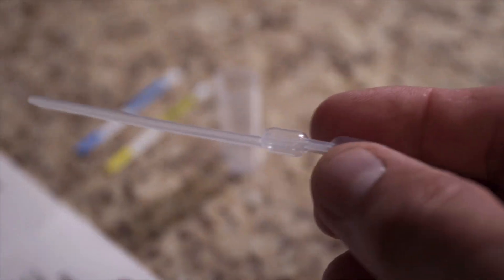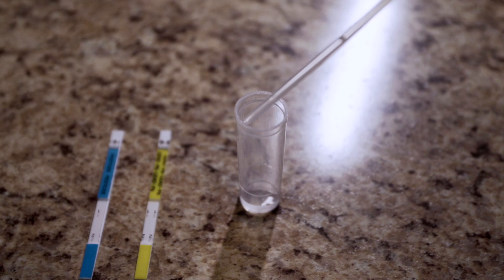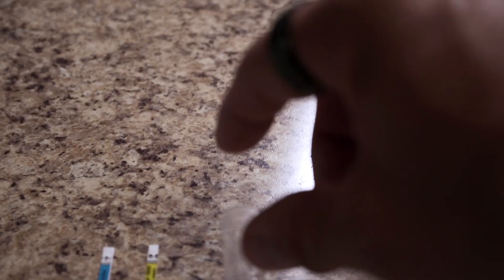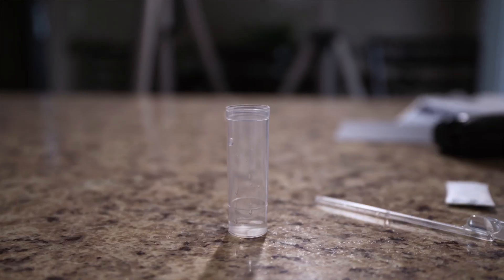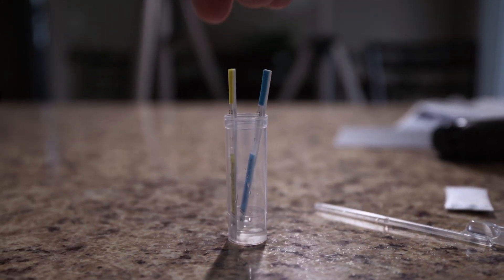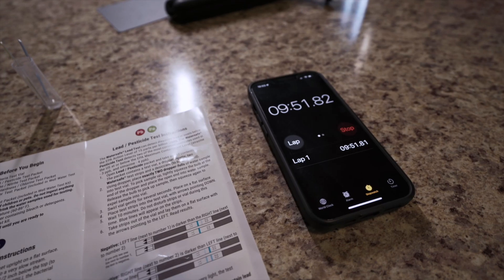We're on to the lead and pesticide tests. They give us a little dropper and we're going to need two dropper-fulls of water. We're supposed to swirl it around and then put the test strips in with the arrows pointing down. These test strips have to sit for about 10 minutes, so let's set a timer.